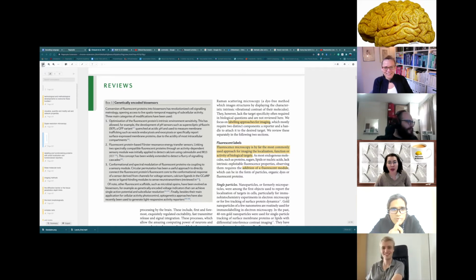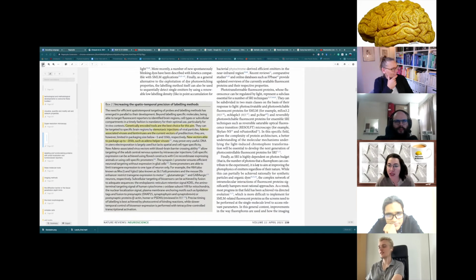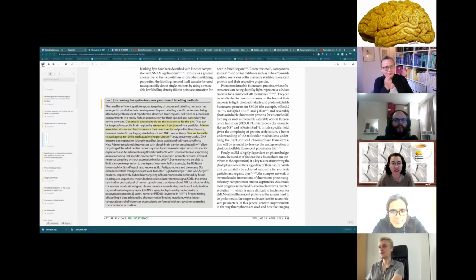Yeah, I just wanted to ask. Hi. I read that there is a paragraph on genetically modifying proteins. Yes. And with this super resolution we are also able to see visually when the folding, for example, of a protein is modified and maybe related to a genetic sequencing. Maybe we are at that level, I was asking.